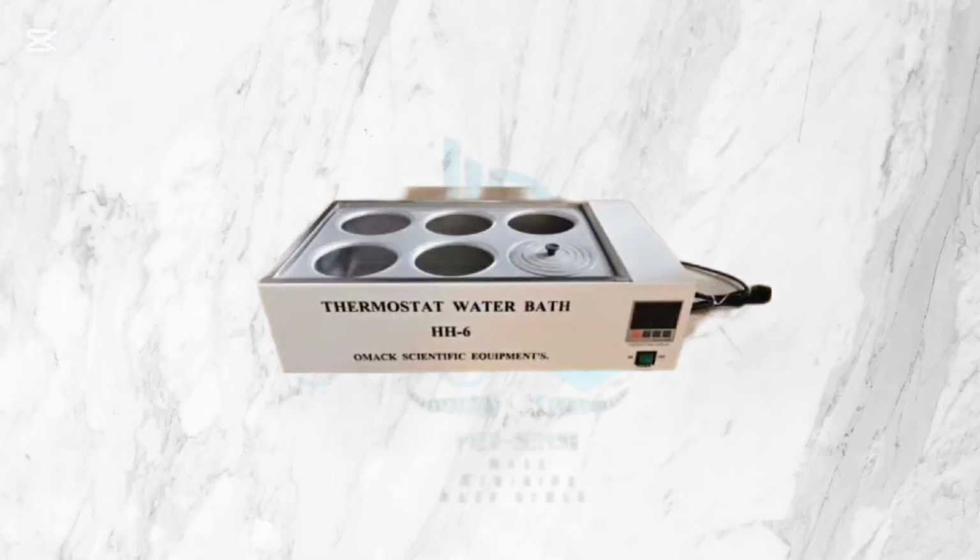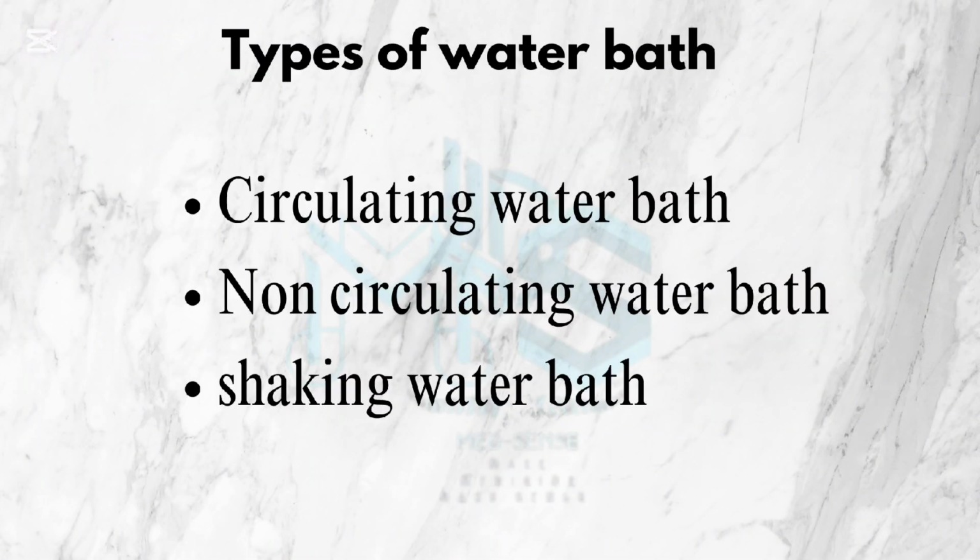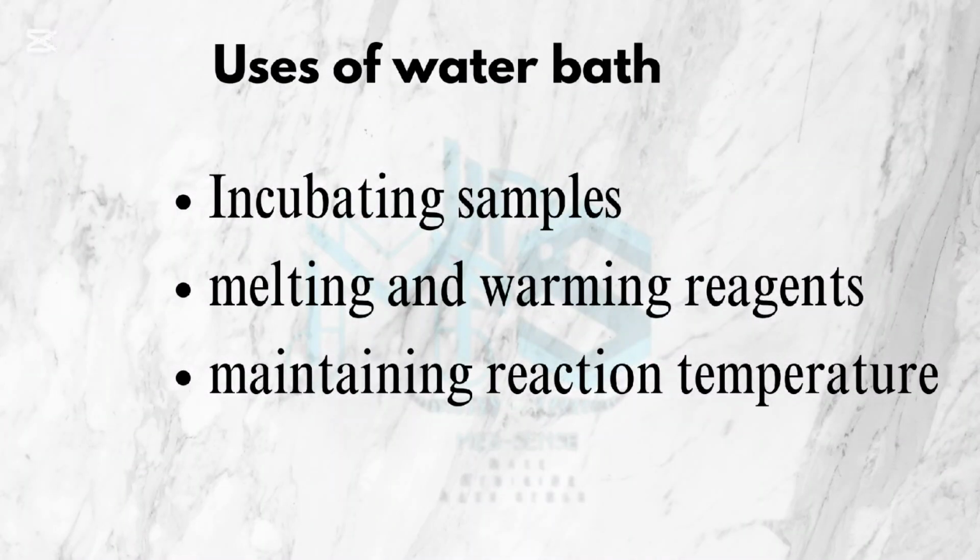So this is the picture of a water bath. Types of water bath: we have circulating water bath, non-circulating water bath, shaking water bath. Uses of water bath: we have incubating samples, melting, warming reagents, maintaining reaction temperatures.